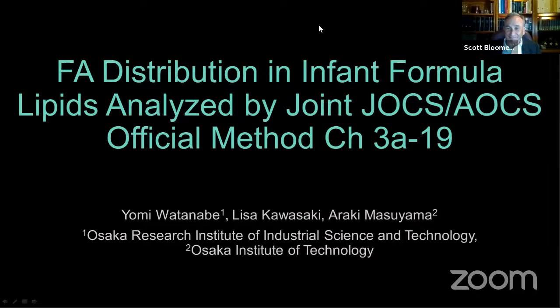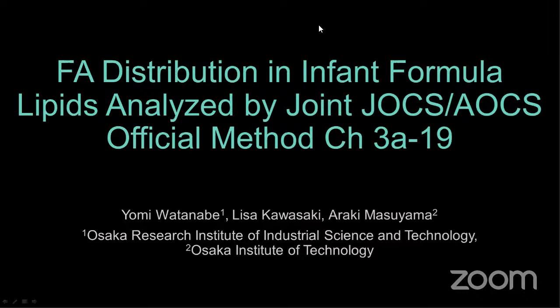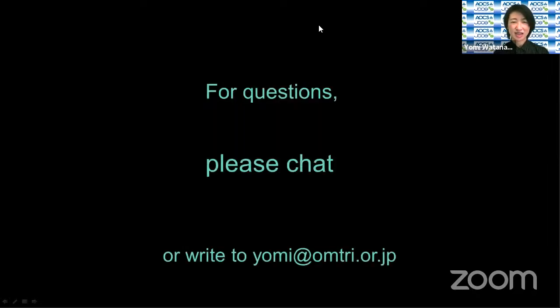Thank you, Scott, for your very kind introduction. Today, I will introduce an improved method for analyzing the distribution in TAG and the application of the method to infant formula TAG. Your questions are welcome. Please use the chat feature, as Scott introduced before, to share your questions. I will answer some questions at the end of this talk.